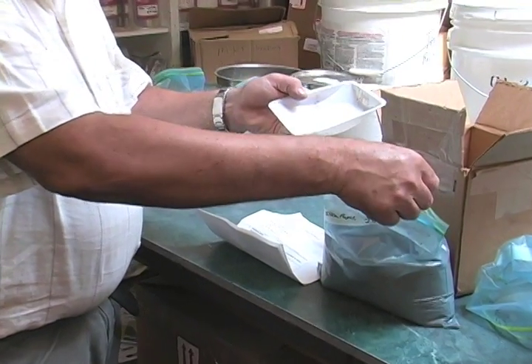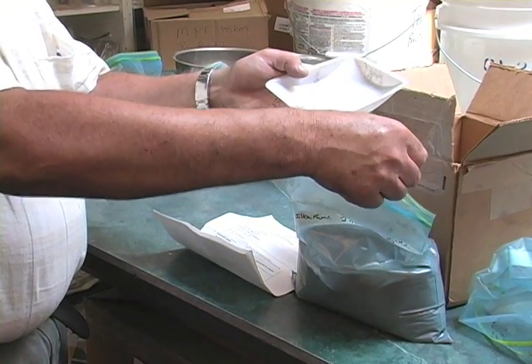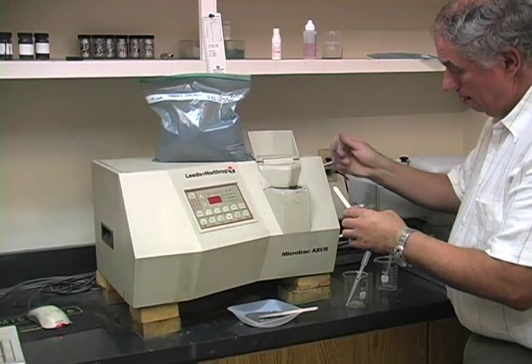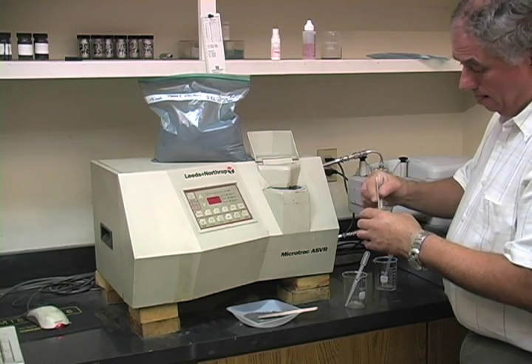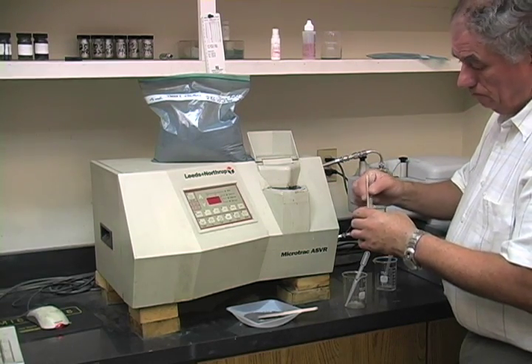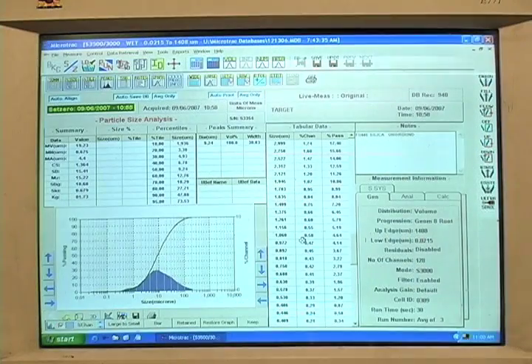A small sample of the material is retrieved. The material is then analyzed in the laboratory's laser diffraction instrument to determine starting particle size. This information, along with the completed questionnaire, will be used to select the appropriate test equipment and milling parameters.